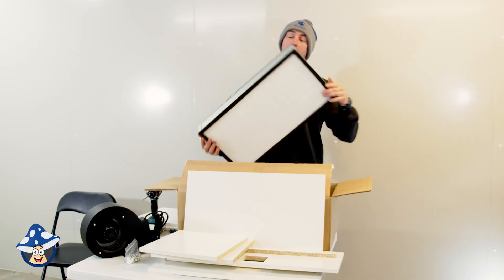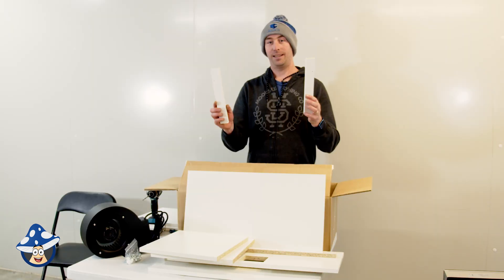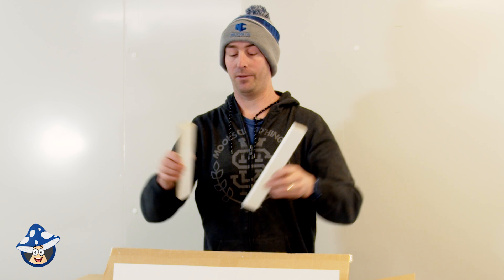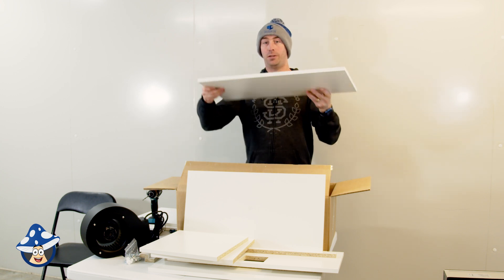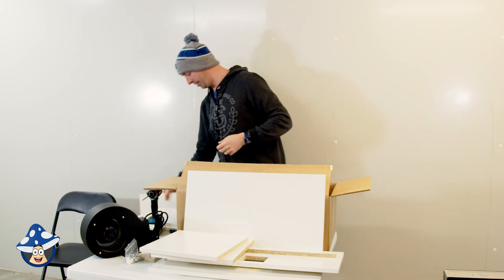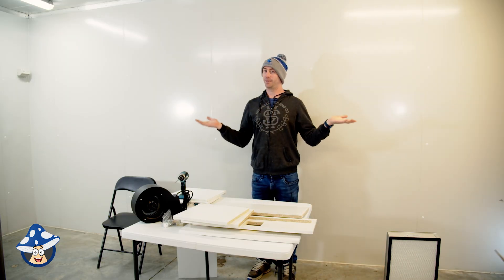Then we have your HEPA filter. You'll see on one end there's a sticker with an arrow on it — you've got to make sure that your arrow faces out. Then we've got two little bits with two holes in them; they're the side bits for your front frame. Then there's one more big piece with two holes at either end and one hole in the middle — that is your top guard plate, which goes with those two side bits with the single holes. Set those aside because they go last. And then there's your box.